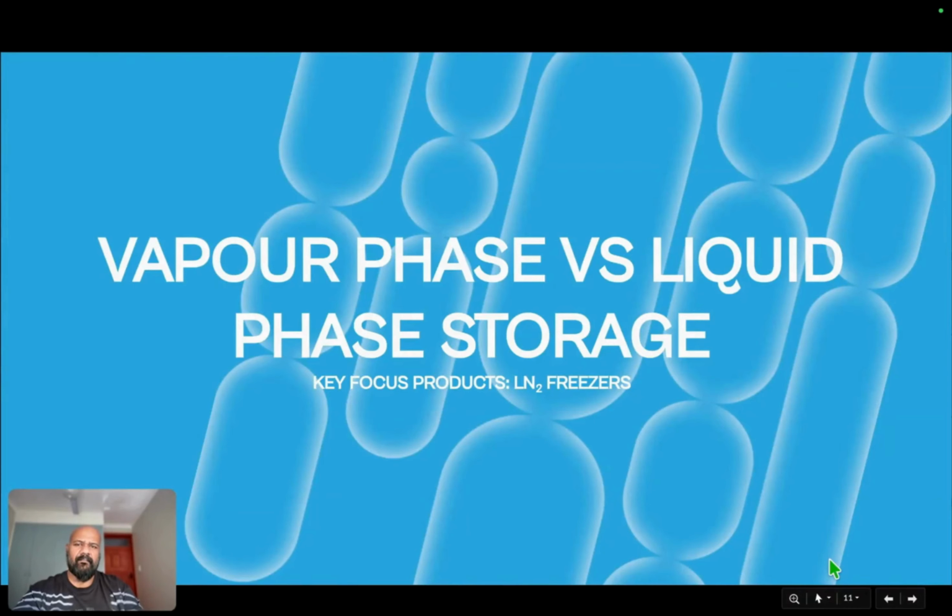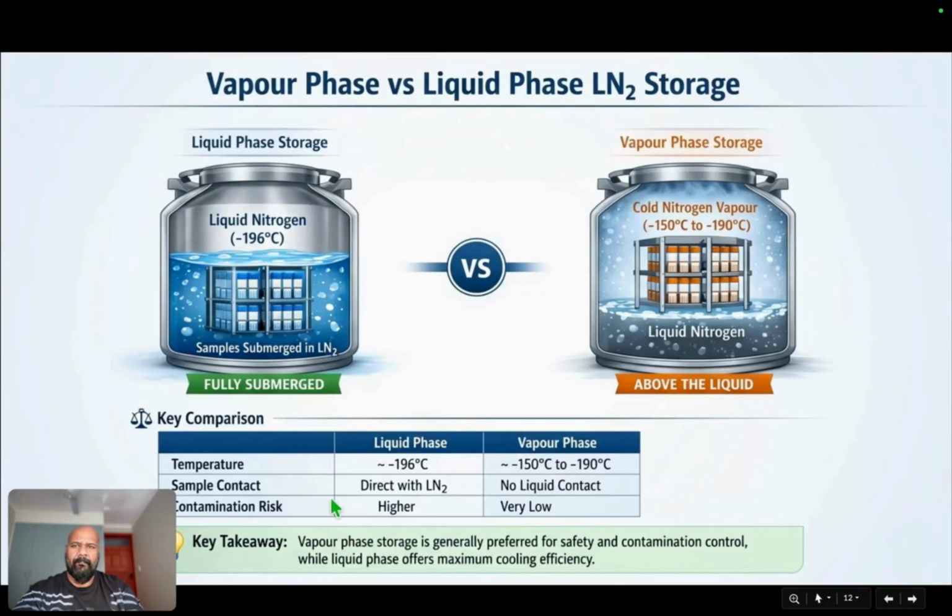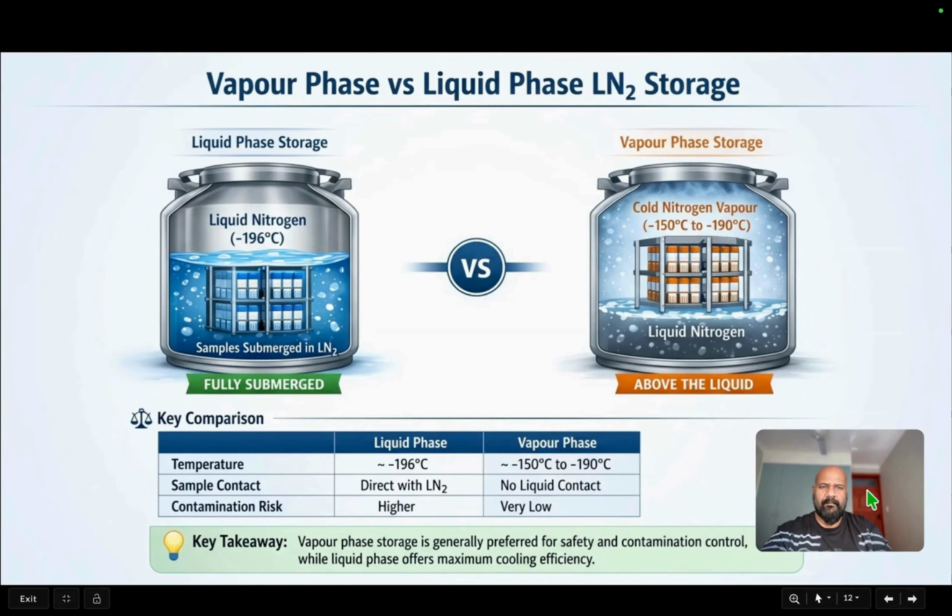Vapor phase versus liquid phase storage. This is a very important concept to understand. So, what's the difference between vapor phase and liquid phase? Liquid phase means storing your samples directly into liquid nitrogen.